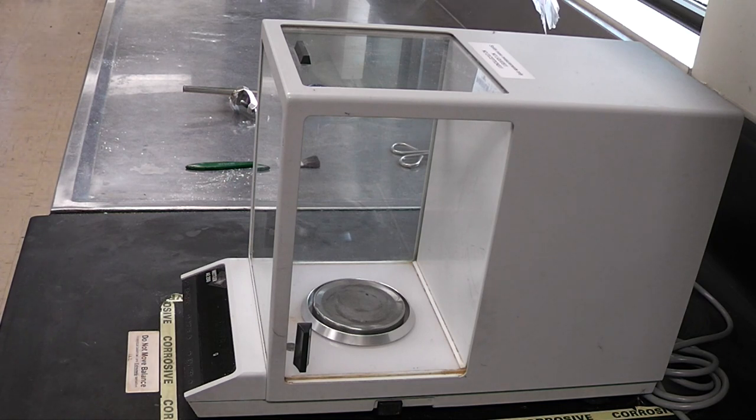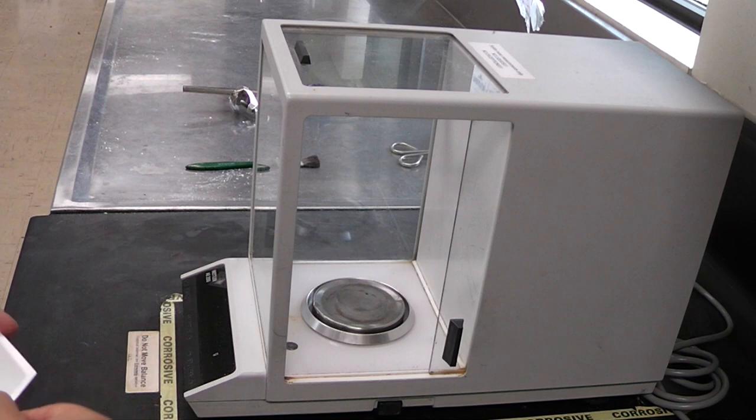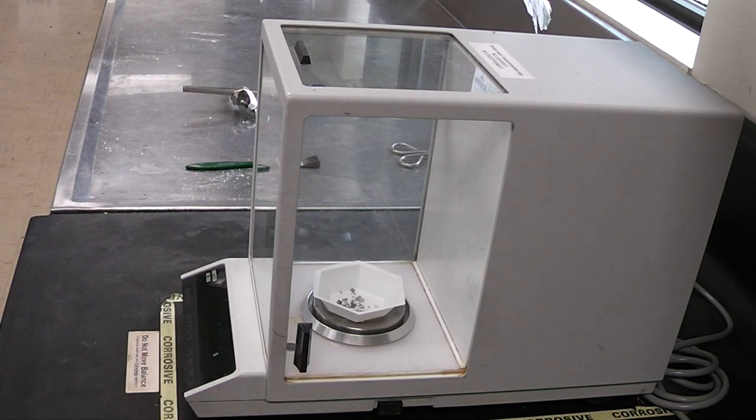Now you're ready to weigh your sample. When you've prepared your sample in a weigh boat, simply slide the glass doors on the side open, place in your sample, and slide the glass doors shut again.